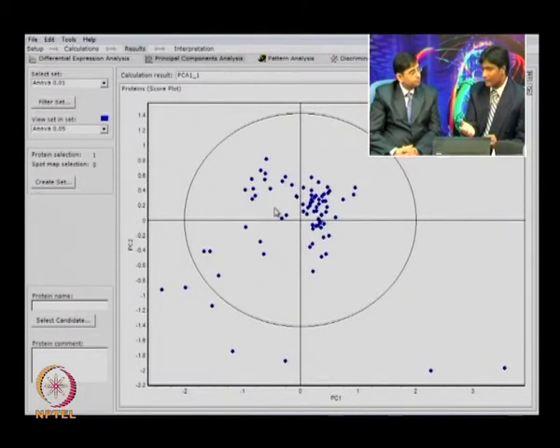The outliers you can see are exactly this: they can be some non-reproducible spots, or, what is the major thing, they are very highly upregulated or highly downregulated. So this can work as a marker also. Then we have to go back to our BVA data and check how exactly that protein is regulating. Then we can identify that protein and use it for further analysis.